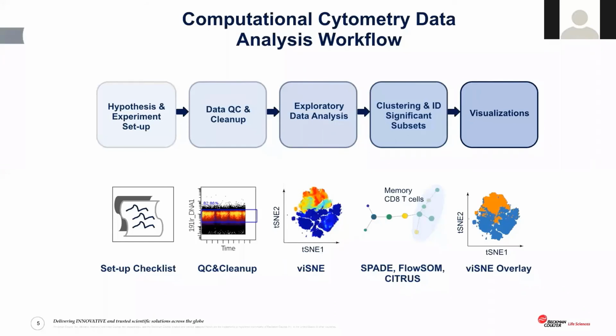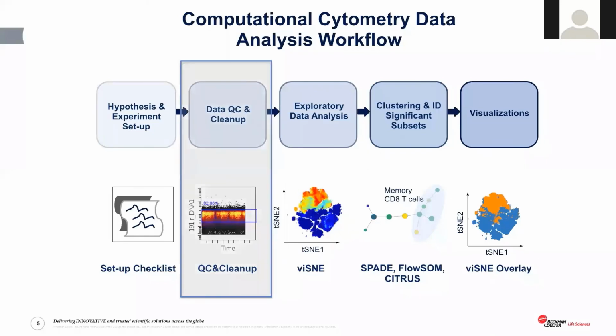A second step is post-data acquisition, where we need to check on the data quality and do a little bit of pre-gating to get clean quality data. The model or the algorithm is only as good as the data quality you put in. The algorithm is not going to differentiate the positive signal generated from data issues such as compensation from the true biological signals. So today we will focus on this part, as I said, to set the foundation for more advanced analysis.